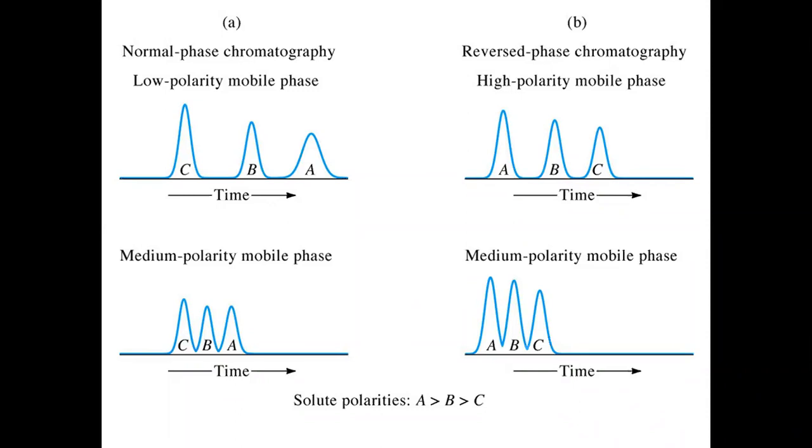The order of elution remained intact, but the degree of separation, or the degree of resolution, is not acceptable. So while using normal phase packings, meaning a polar stationary phase, use a non-polar mobile phase. While using a non-polar stationary phase, use a more polar mobile phase so that you can achieve the required separation with greater efficiency.